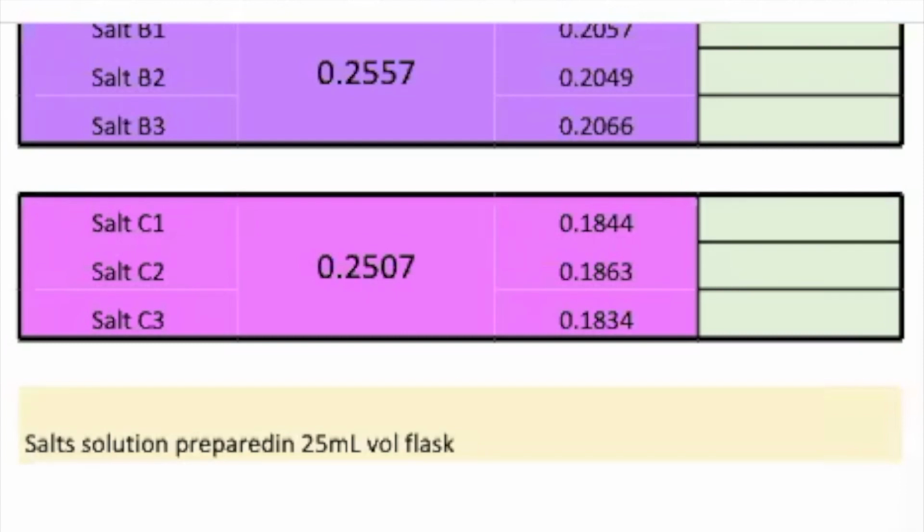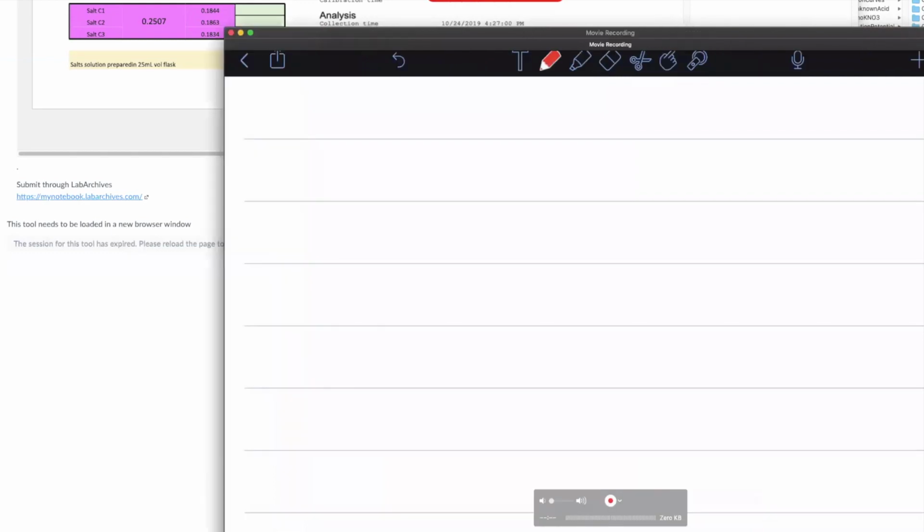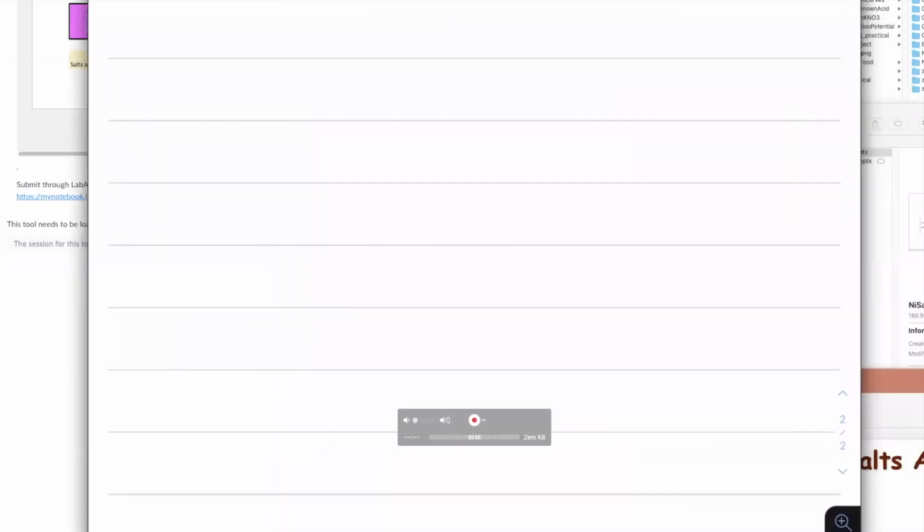Let me just give you an outline of the calculation that you are going to be doing. So here's what you are going to be doing in your analysis. You're going to have, say, Ni(en)x(H2O)6-2x SO4·yH2O.